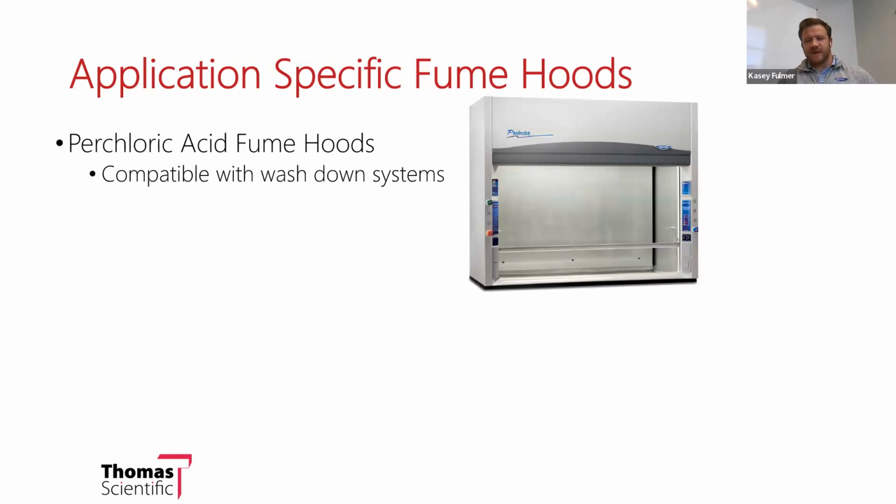And that is because whenever you're heating perchloric acid, it has a chance to condense in the ductwork, and as that condensation evaporates, it leaves behind something called perchlorate, which is highly explosive. So a hood that is on a washdown system, that washdown system is in the ductwork, and it will wash all of that perchlorate out, making sure that it's not allowed to build up into these hazardous levels of perchlorate.